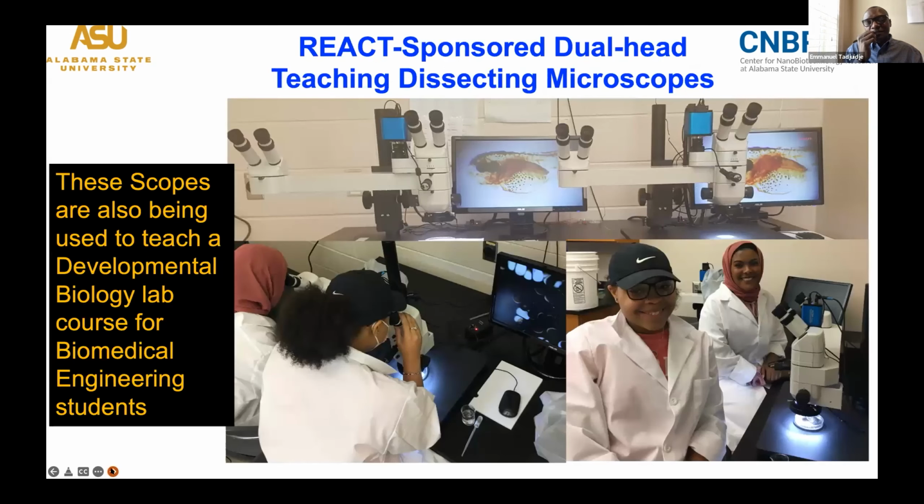Now, during the course of this project, owing to the REACT funding, we were able to acquire two dual-headed teaching dissecting microscopes, which have been very instrumental, not only in helping carry on the project with Michaela and Hagia. They have also been very helpful to me because I also teach developmental biology labs for biomedical engineering students. So these scopes have allowed me to carry on those classes with a lot more ease than with the microscope that I had before.